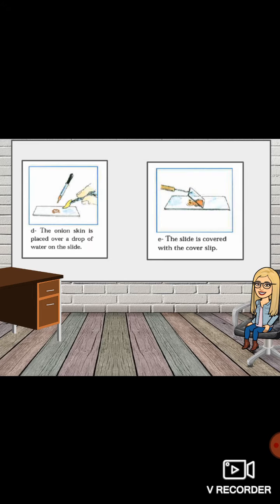D. The onion skin is placed over a drop of water on the slide. E. The slide is covered with a coverslip.